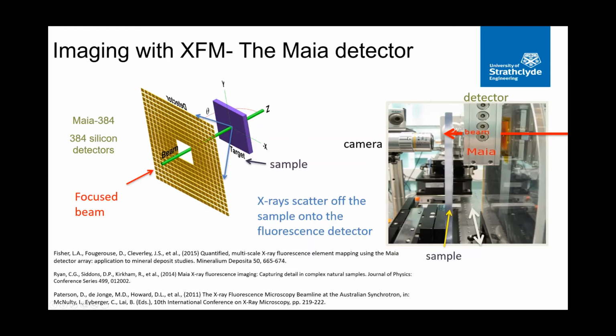This is a microscope lens to get your positioning of the sample. And the sample is mounted on very fast motors that enable fast scanning. And these are capable of analysing anything from a few millimeters to vast paintings, such as when they analysed the Degas painting to discover works of art that had been previously painted over.